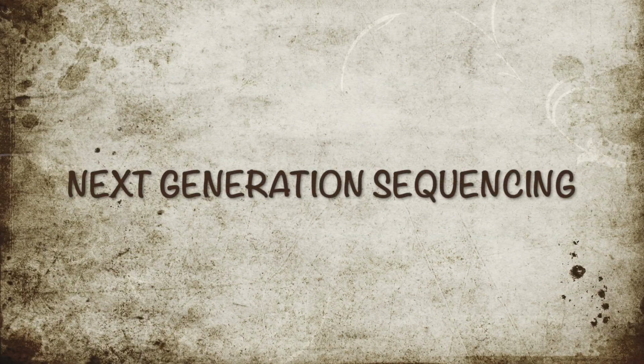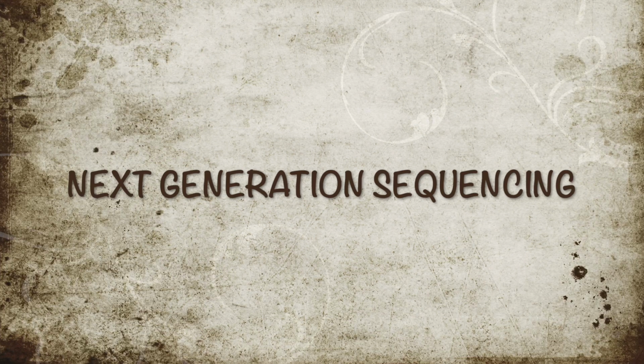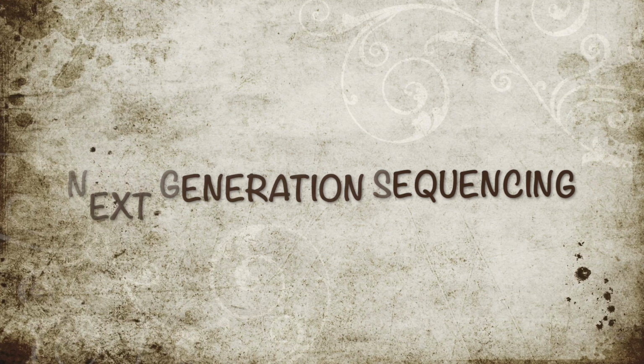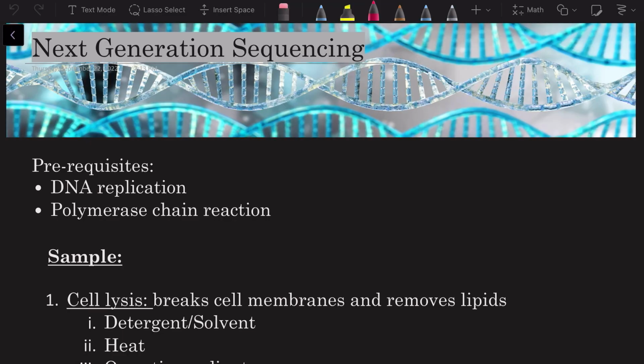So I know I said that my content will be mostly heme path heavy, but this month I was on molecular pathology rotation and I came across next generation sequencing. And it is a truly fascinating subject. At most of the steps of this process, I was going like, wow, that's brilliant. It's genius. How can somebody even think about this process? I'm stupid enough that I'm just thinking about what the next episode of House of the Dragon would do, and people have just thought about this miraculous thing here.